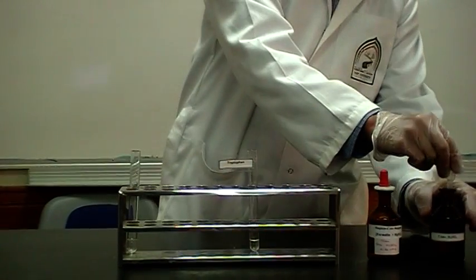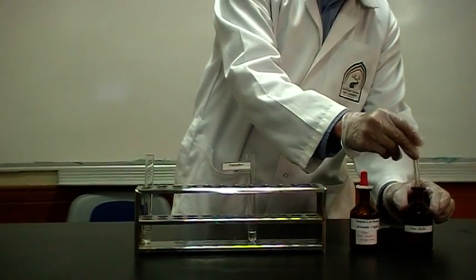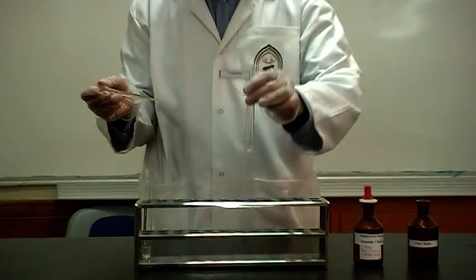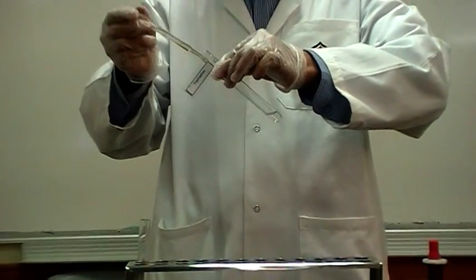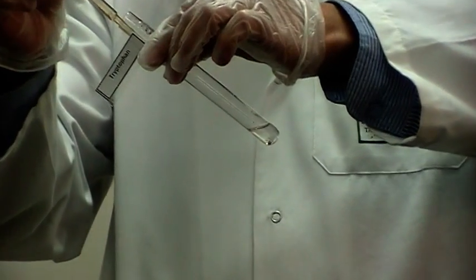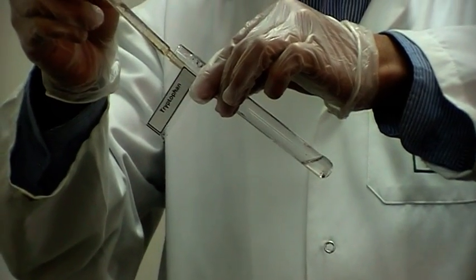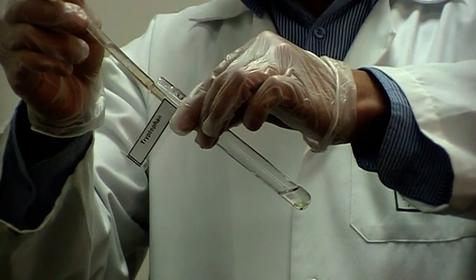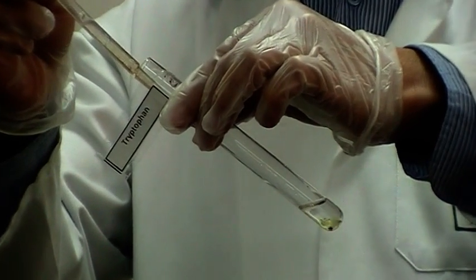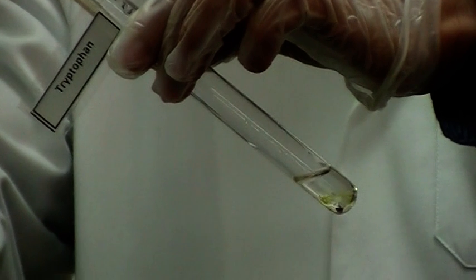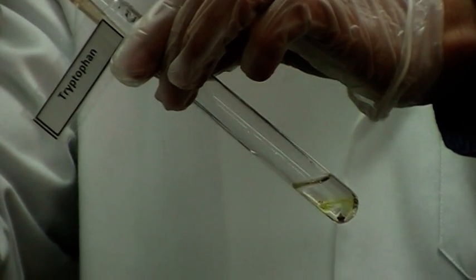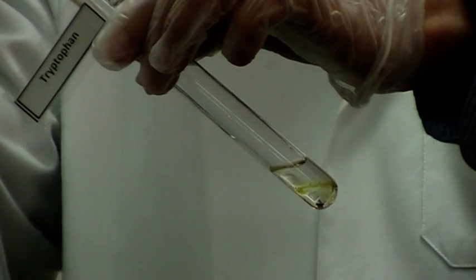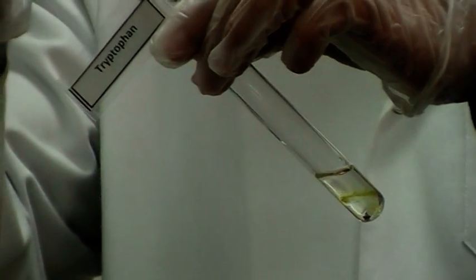And then be very careful about adding around 2 ml of concentrated sulfuric acid to the side. Let's take this tube. Slowly add around 2 ml of sulfuric acid.